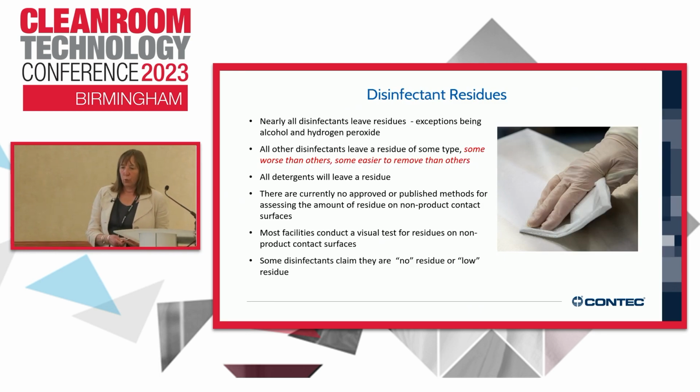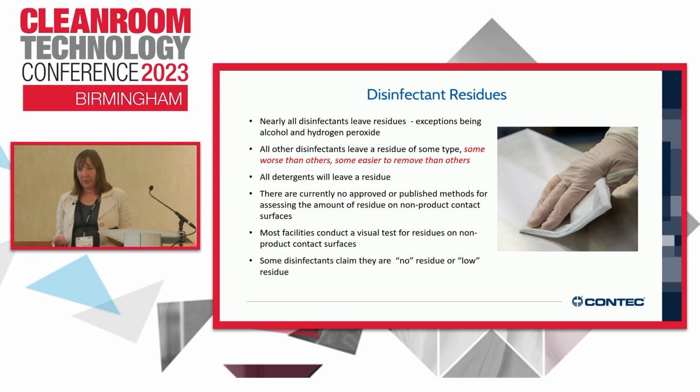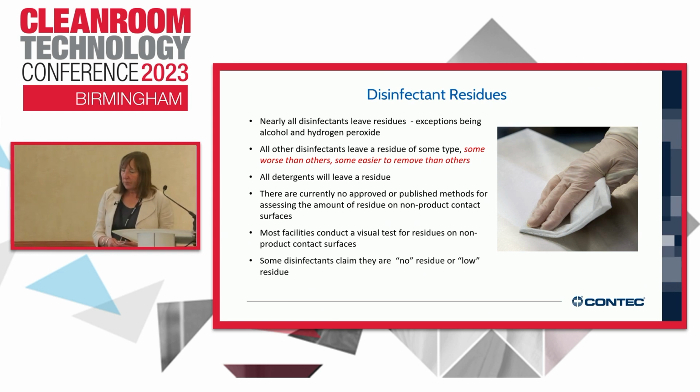So almost all disinfectants will leave a residue. The exceptions are alcohol, 70% IPA or ethanol, and hydrogen peroxide. Everything else will leave a residue of some description, and some are worse than others. All detergents with surfactants in them will leave a residue. And there's no really approved standard of assessing how much residue is too much and the removal of it, really. So I suppose as part of your CCS, you need to have something in there to demonstrate what you've done and why you've done it.